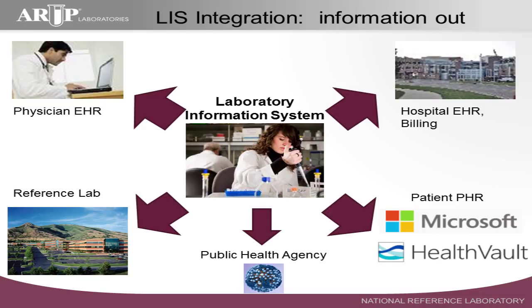That's very common today. We have many interfaces set up across the country with different hospitals' laboratory information systems. Very common. And also, public health agencies. Right now, ARUP as a reference lab has to deal with the different health regulations in 50 states. And it does vary state by state. And I'm sure Karen may have touched on that.